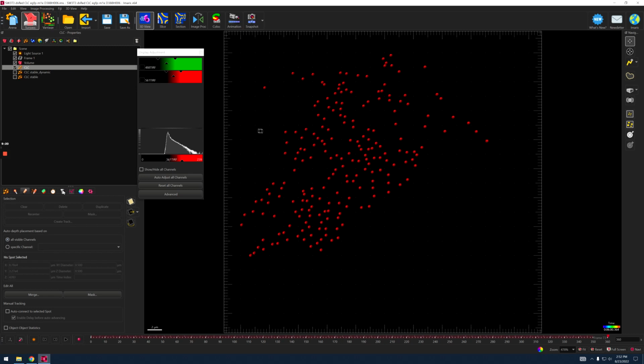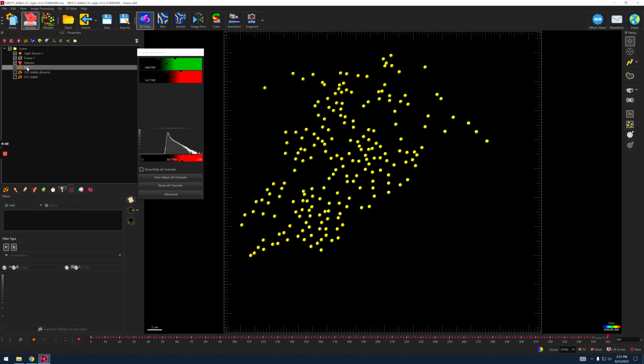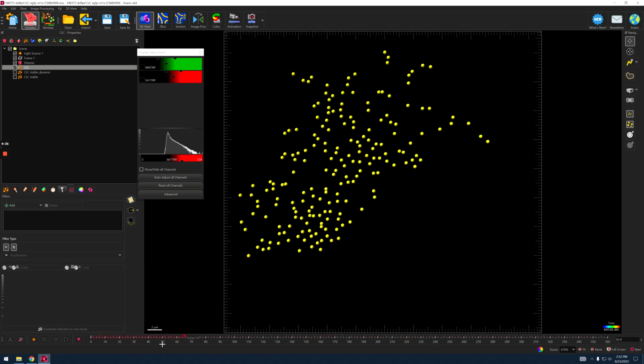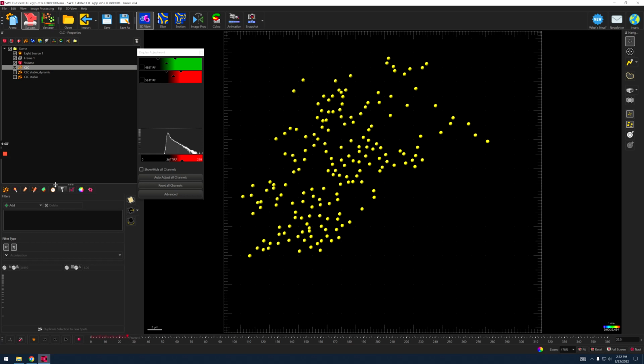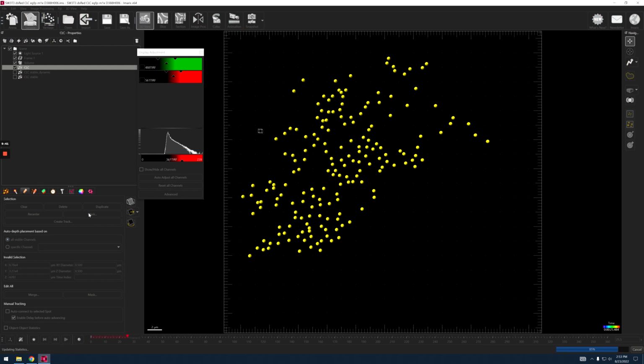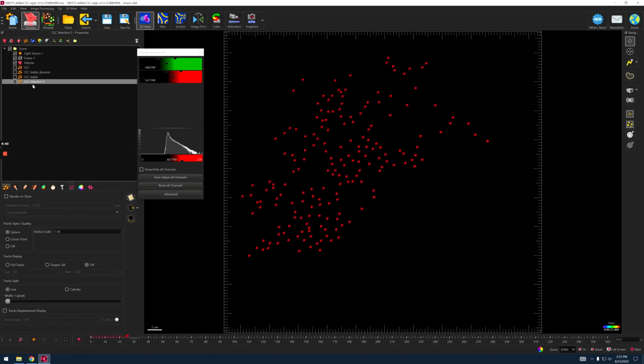So I would select CLC and then click the funnel, and before selecting anything, you already see everything has been selected because it's all turned yellow, right? At this time, you just duplicate the entire channel, and so you get a CLC selection 2. This is your duplicate straight from CLC.